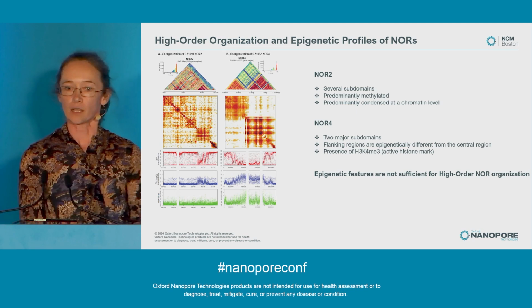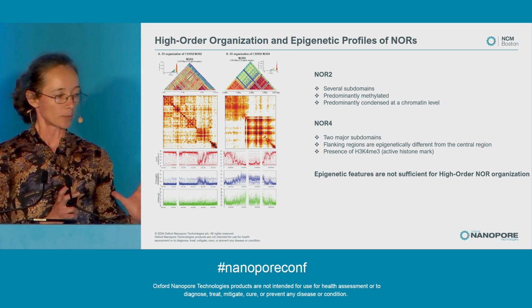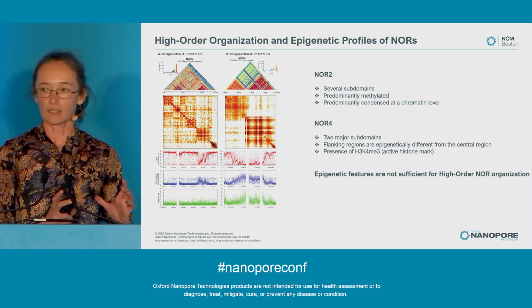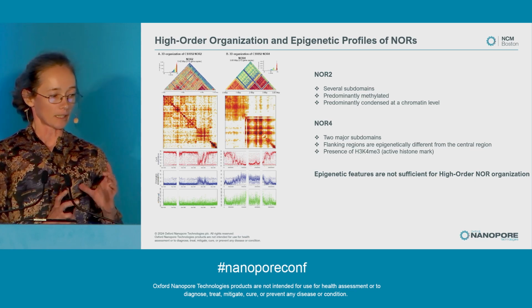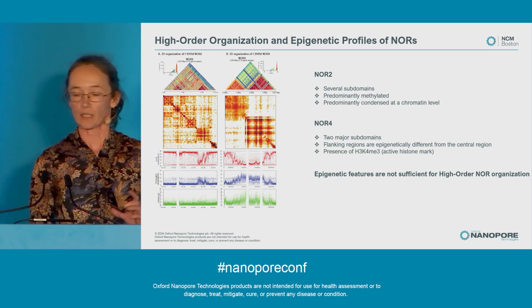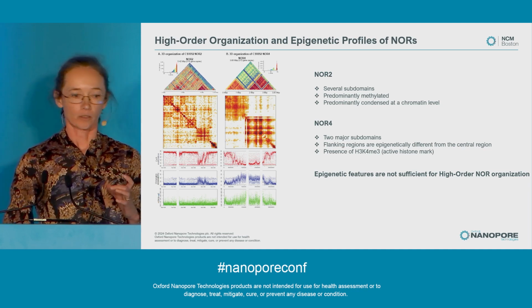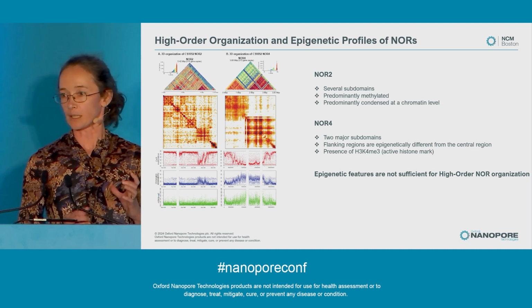So in this slide, I'm further zooming in on each NOR. On the top is, again, Pore-C data, which shows more detailed information about the organization of each NOR. And you can see here that both NORs have additional subdomains. NOR2 has several subdomains. NOR4 has two major subdomains.